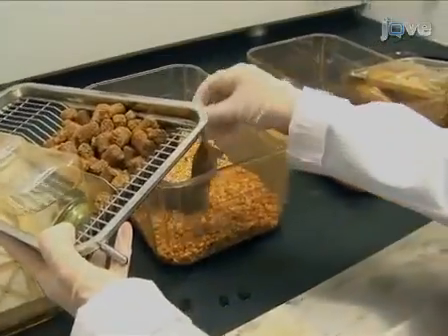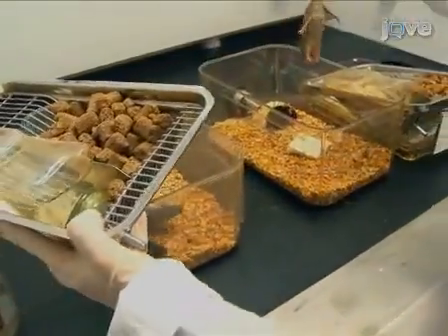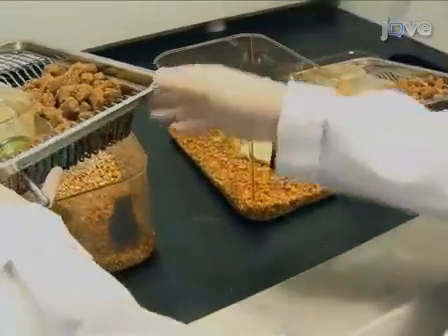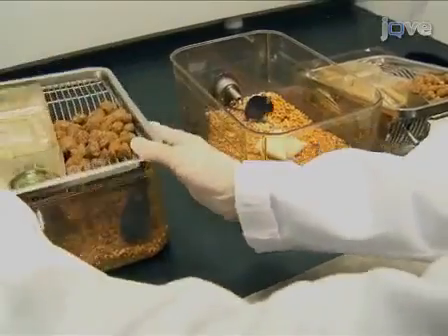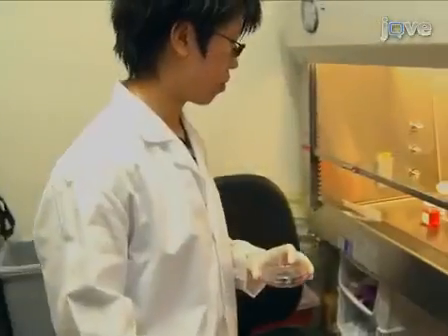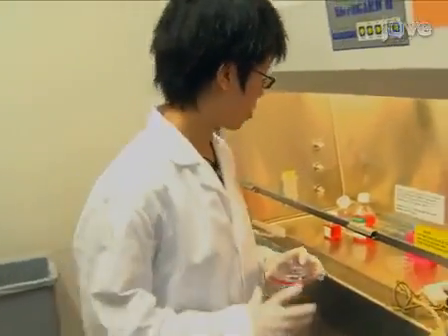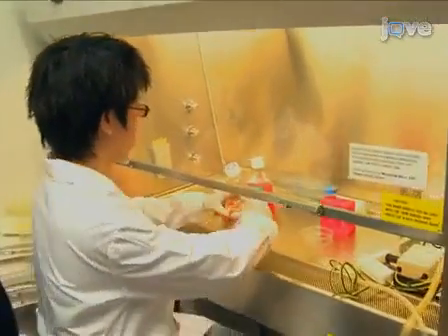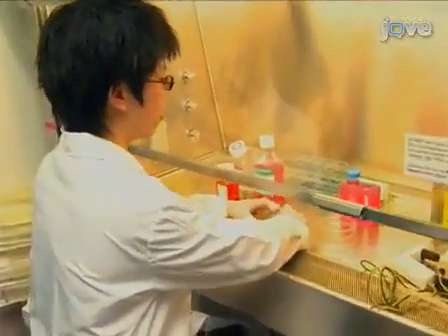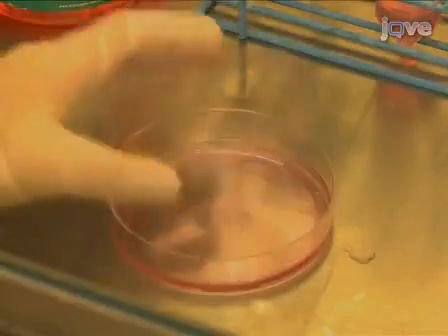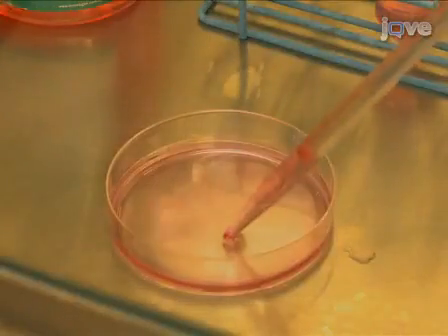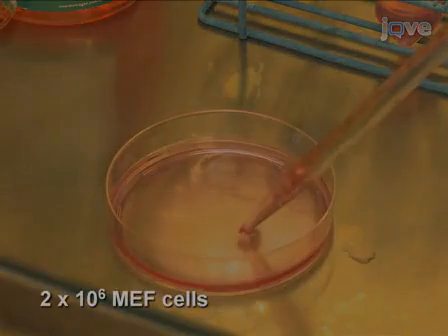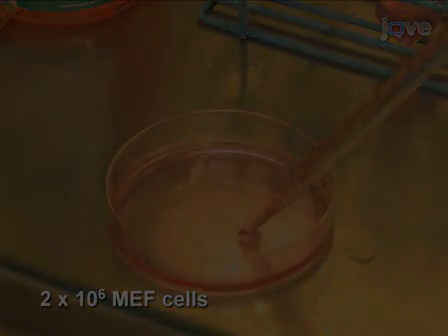To begin this procedure, set up a breeding cross between your mice of interest. Next, prepare mouse embryonic fibroblasts or MEFs as feeder cells. Two days before the collection of blastocysts, plate MEFs in 100mm dishes.